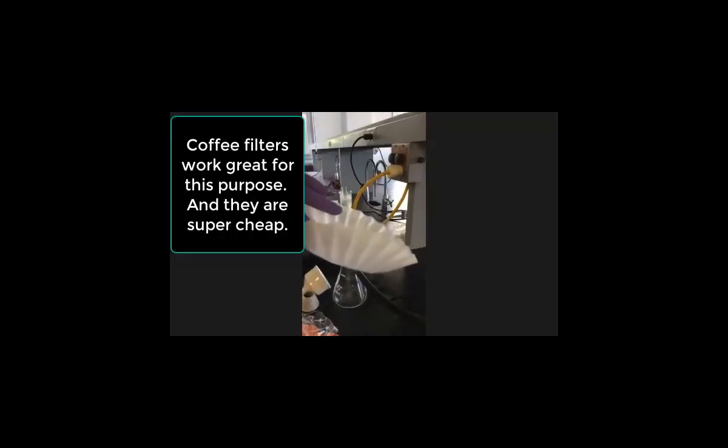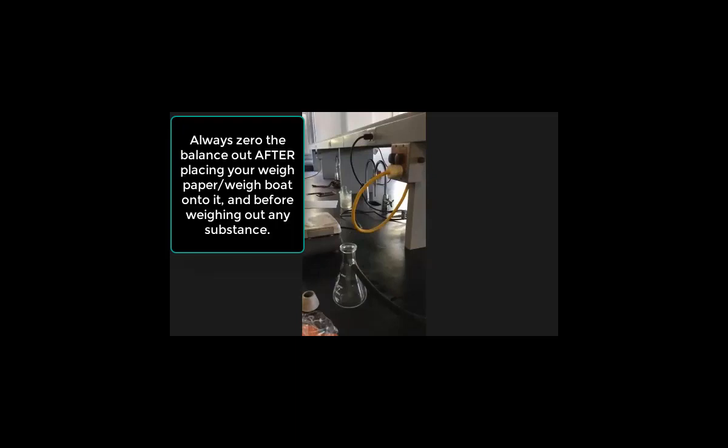So we're going to take a piece of a coffee filter, just a regular coffee filter, 100, 200 for $1 at Walmart. And we'll sit that down into here. Now I know it's kind of big, but that makes it better at the end, because then you can just lift it out. And if it doesn't want to seat right, you can always just drop a little bit of water onto the filter to seat it down into the funnel.